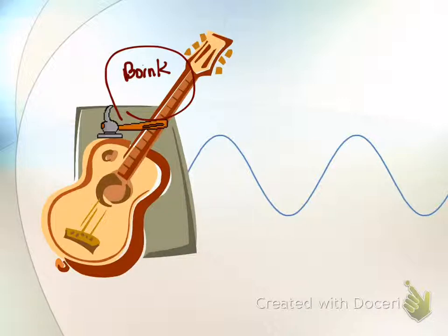So if you think about what this looks like on a graph, here's intensity, here's time. It doesn't look like a continuous sine wave. What it looks like is this. This is the hammer.